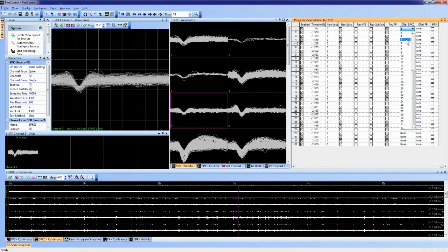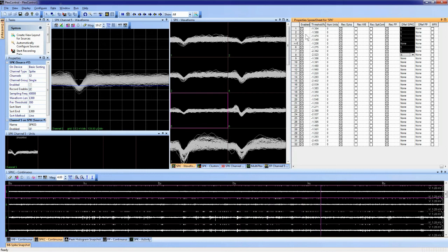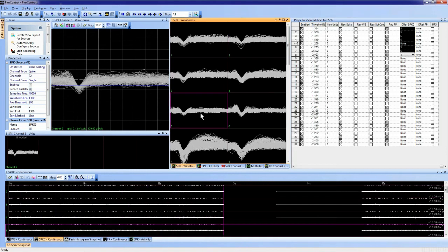I'm going to set all of them back to channel 5 because that's what we'll be using for the rest of the webinar. So now we're back to using channel 5 as the reference.